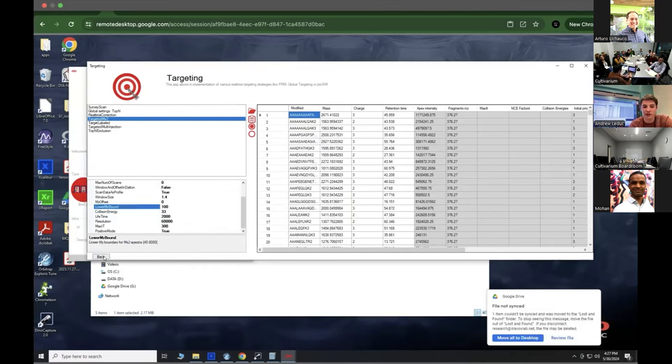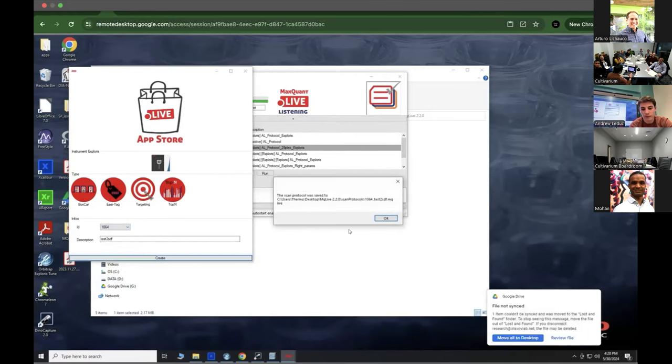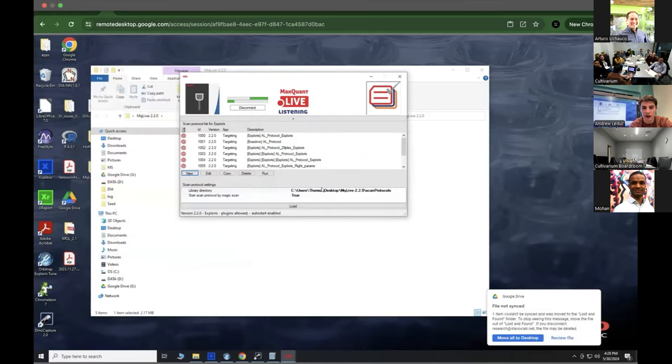So I've edited my method a little bit. I've loaded in my targeting list and I gave some additional instructions to the instrument. Hit back. I have to put in a description. Test two, whatever. And this will be method number 1064. Great. Okay, scan protocol was saved. So now it's in here.